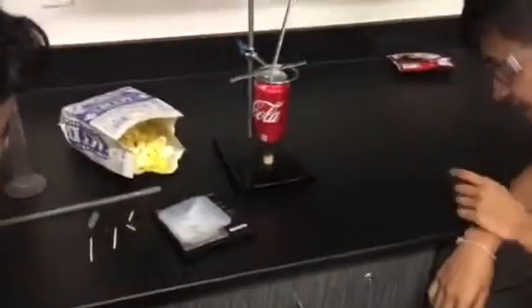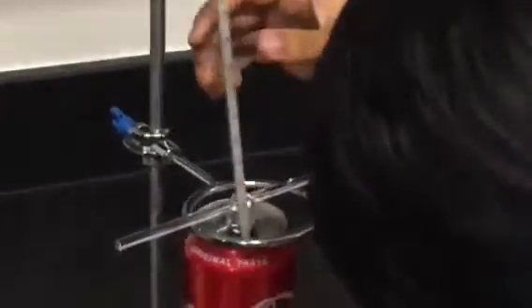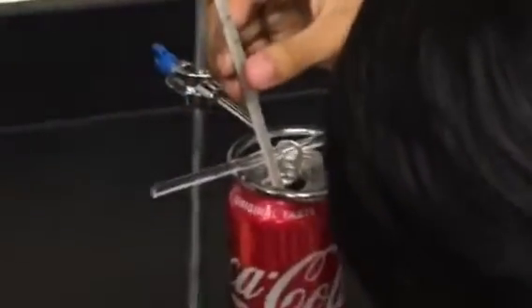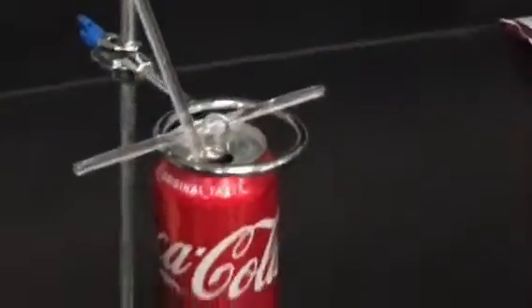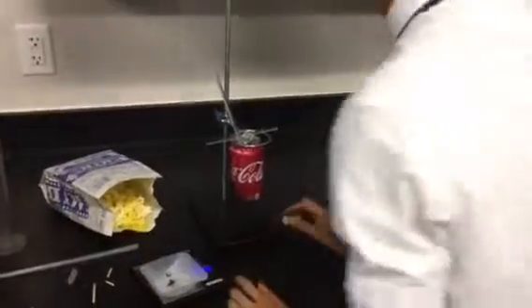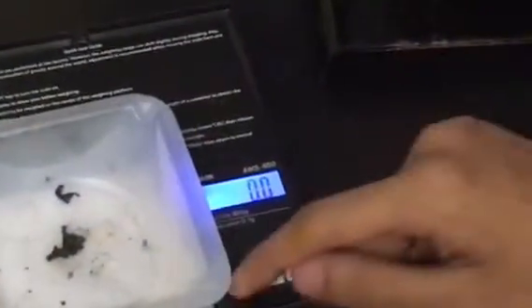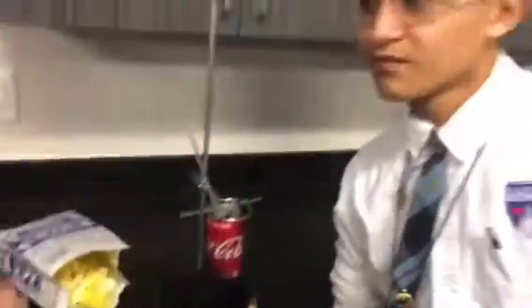Okay. Measure the temperature of the water. Temperature of the water. Holy crap. 36. 36 degrees Celsius. Okay, what's the mass of the popcorn? Load. Tap. Wait, left it over here. Ta-da! 0. No different results.